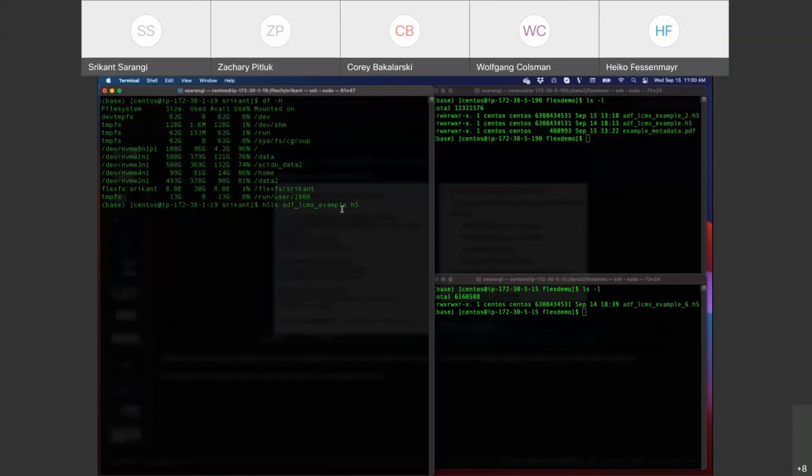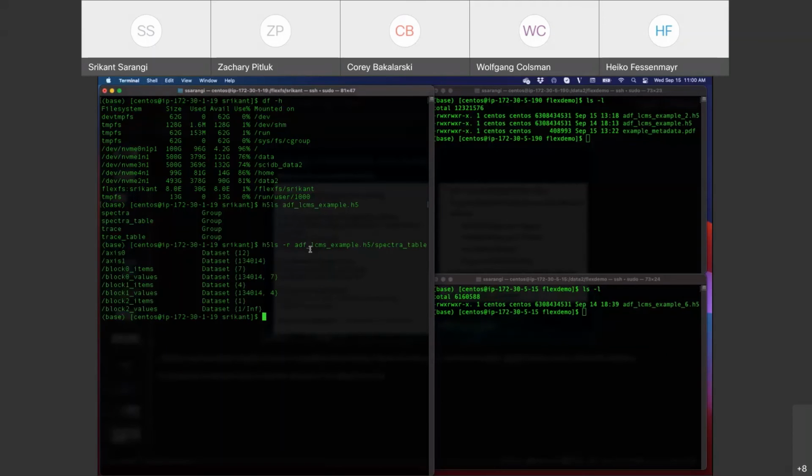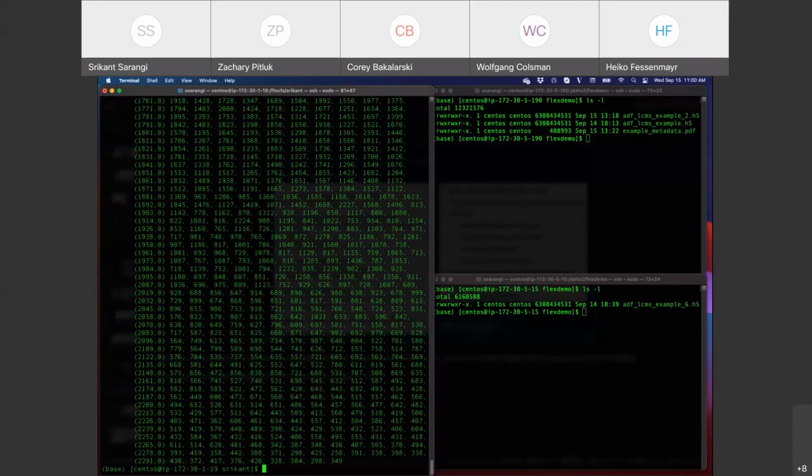We can look through the example data set, which I picked out from the Allotrope portal, using just HDF5 functions. We can look at the different data sets within a particular group in the file, and other simple things like viewing the data set in a table, which gets you the actual raw data. We can view contents of a specific data set.